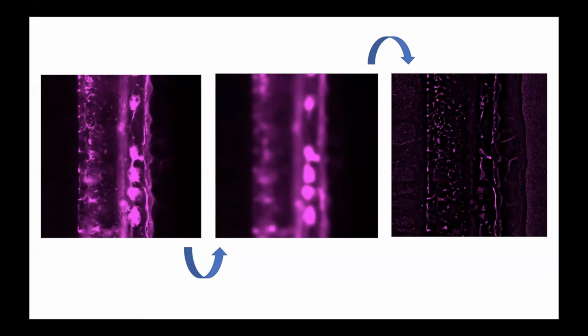This option is very useful because it levels the intensity level in cilia, and basically all cilia will have the same level of intensity after using this option. It also removes the larger background noises like these that you can see here, and we can segment the cilium very well from the background using this option.